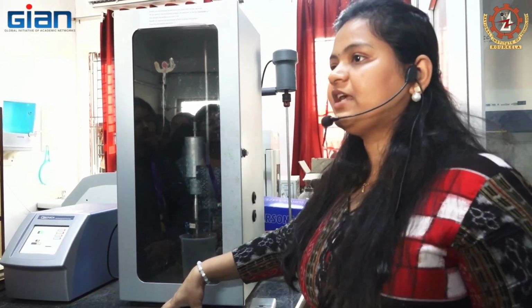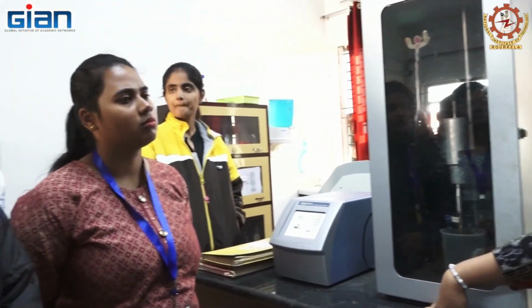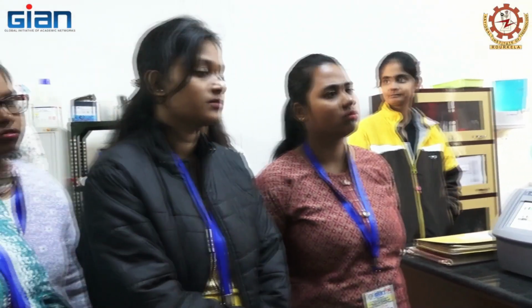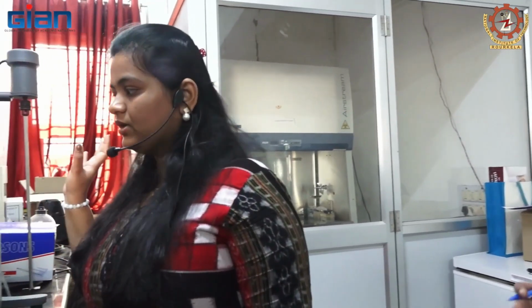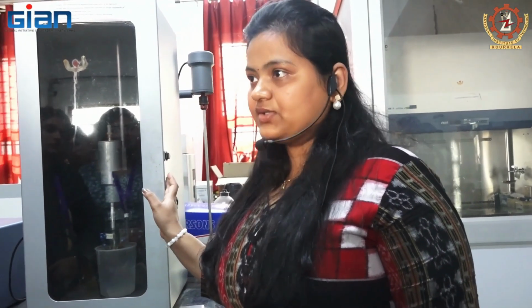Then what are the disadvantages? Any guesses, what are the disadvantages in the field? Operators should be skilled enough to operate, to demonstrate or to experiment these things. Also, ultrasound is very costly actually.